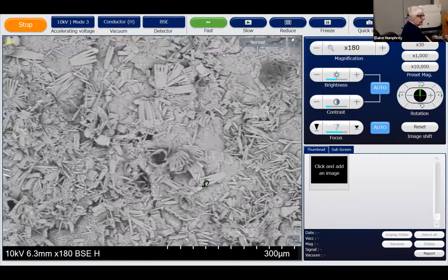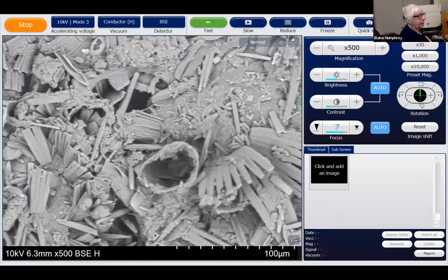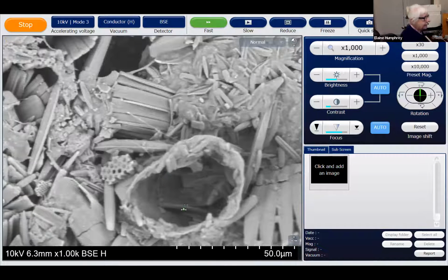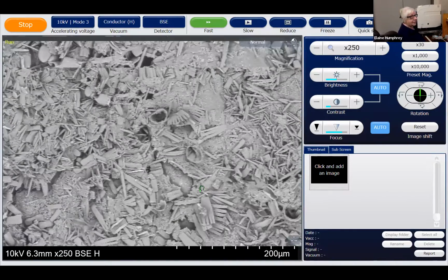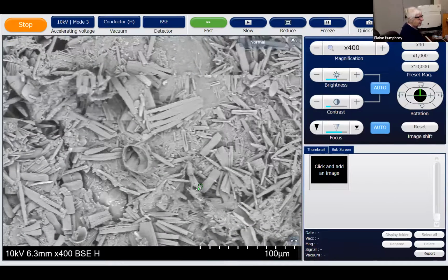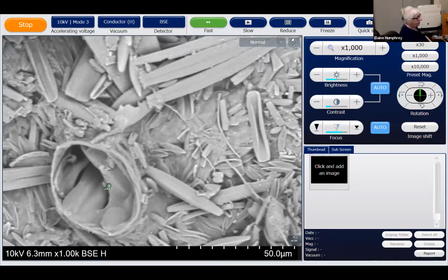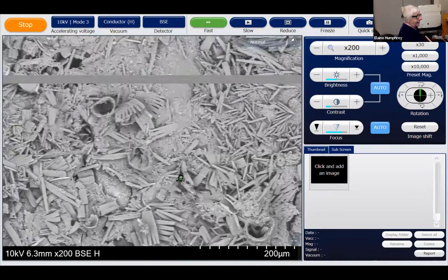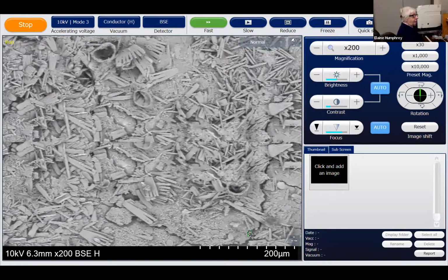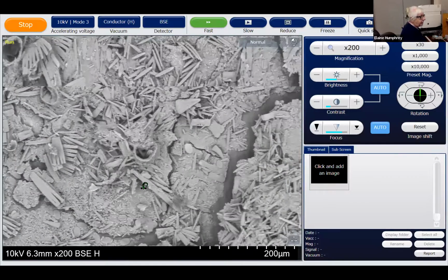Have a look at this one. He's actually not only covered, he's not only eating his food, he's covered in it. So he's got the biscottis in his mouth, these guys over here. Yep. And then, what about this guy? So you can see that there's a lot of tintinids on this thing. Oh, yummy. Yeah. Mind you, I'm not sure I'd like to eat diatoms because you've eaten all that glass. And this guy here's got filled up with them, with the tabularia, with the French fries.